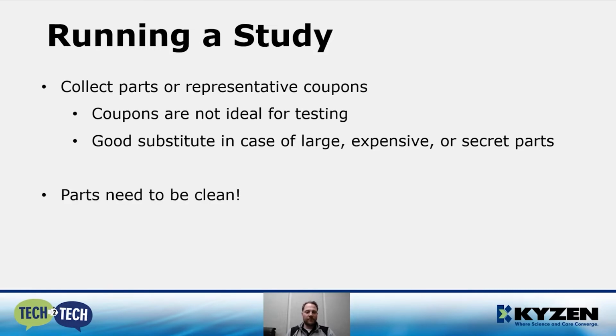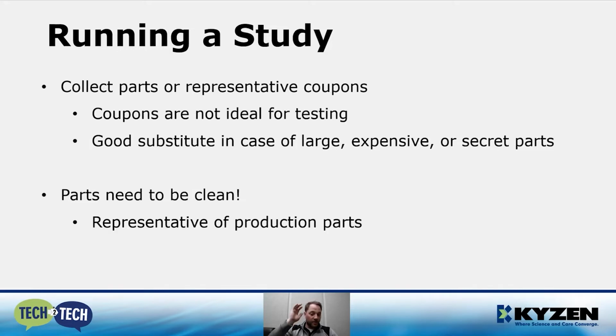The parts that we're going to be running the study on need to be clean. They need to be representative of what is coming off of your production line. For testing purposes, if you can clean your parts and send them to us cleaned, that would give us the best representation of your production parts. Or maybe you have some sort of specification that we can meet on our end, and then instead of you cleaning the parts and sending them to us, we can have that spec and clean them in house and then use the parts that we cleaned in house in the humidity chamber.